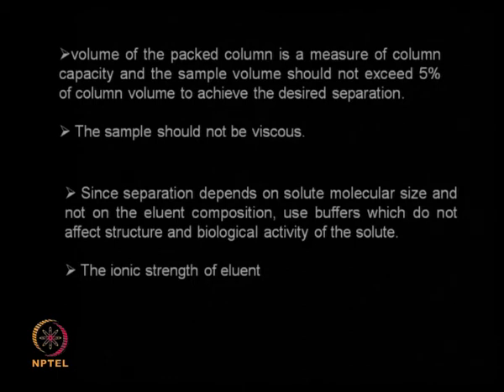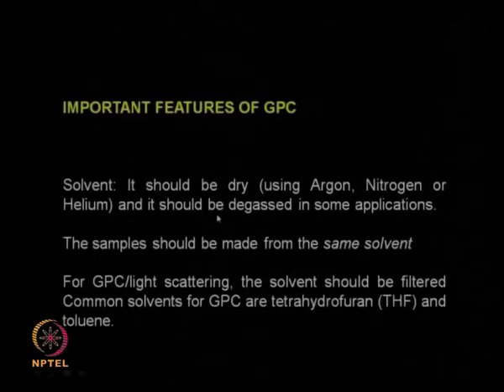We do not want to disturb the shape and size by adding buffers which affect that. The ionic strength of the eluent is also very important, because the ionic salts present should not again affect the protein present inside the separation system.